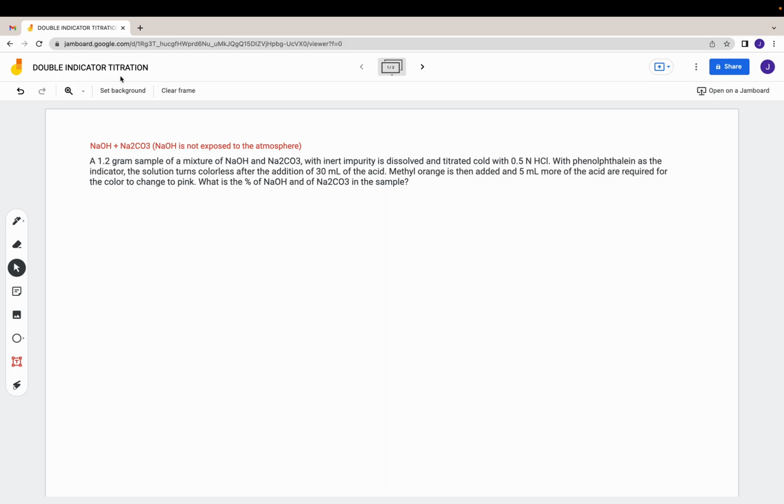So what is really happening here is you have a titration setup. I would like to apologize ahead of time, I don't really excel in drawing. Can you just imagine this is a straight burette? Let's just assume this is a good burette. It's straight, and on the bottom you have your conical flask. This is your titrant, you can remember that one: top titrant, and on the bottom you have titrand, D for down.